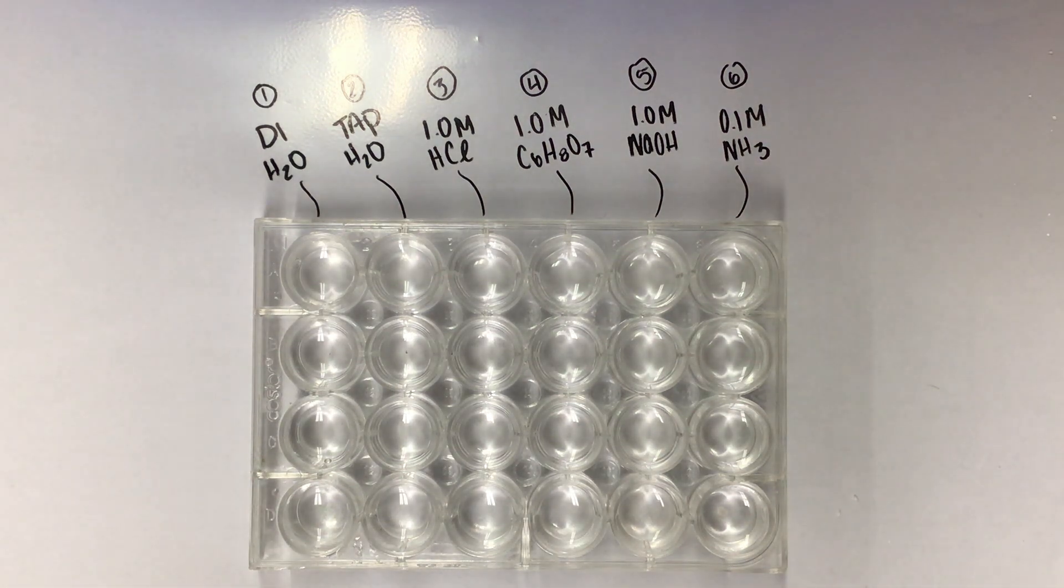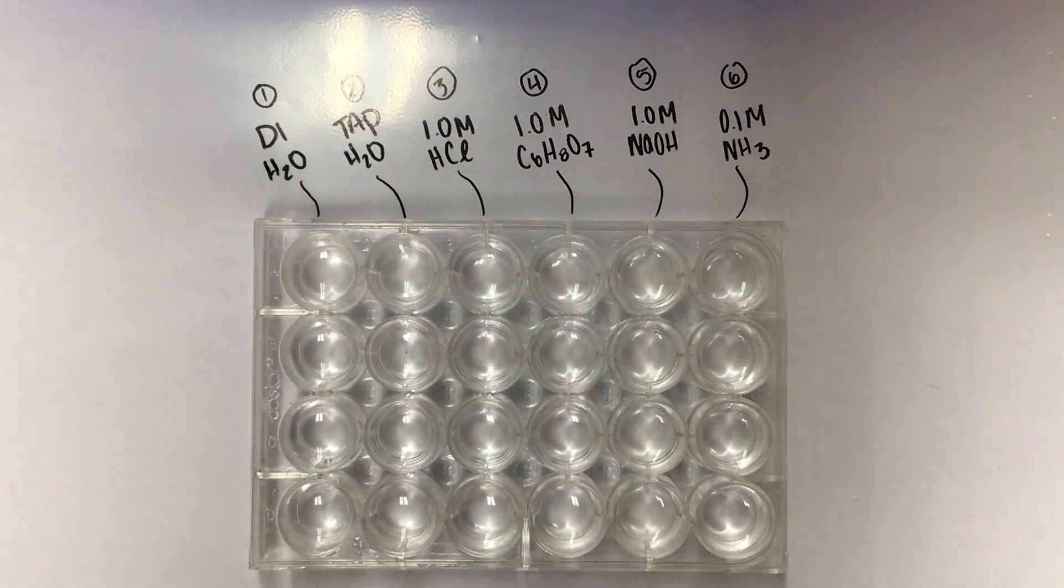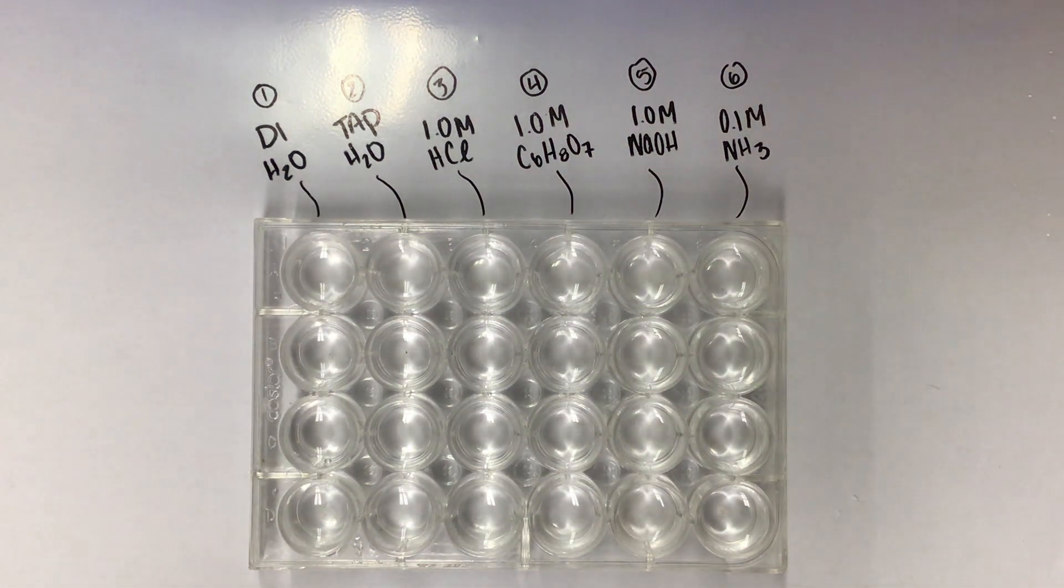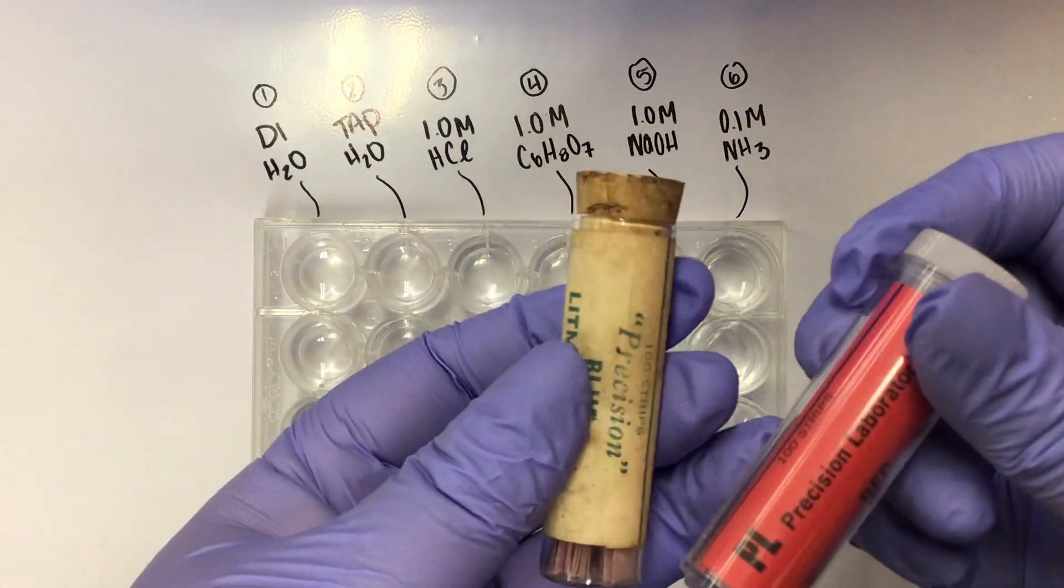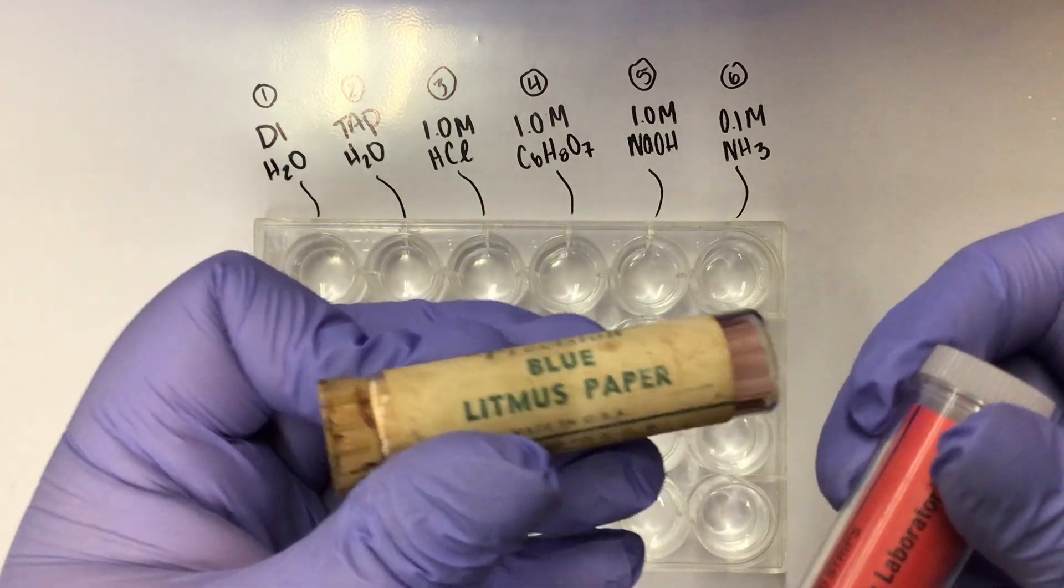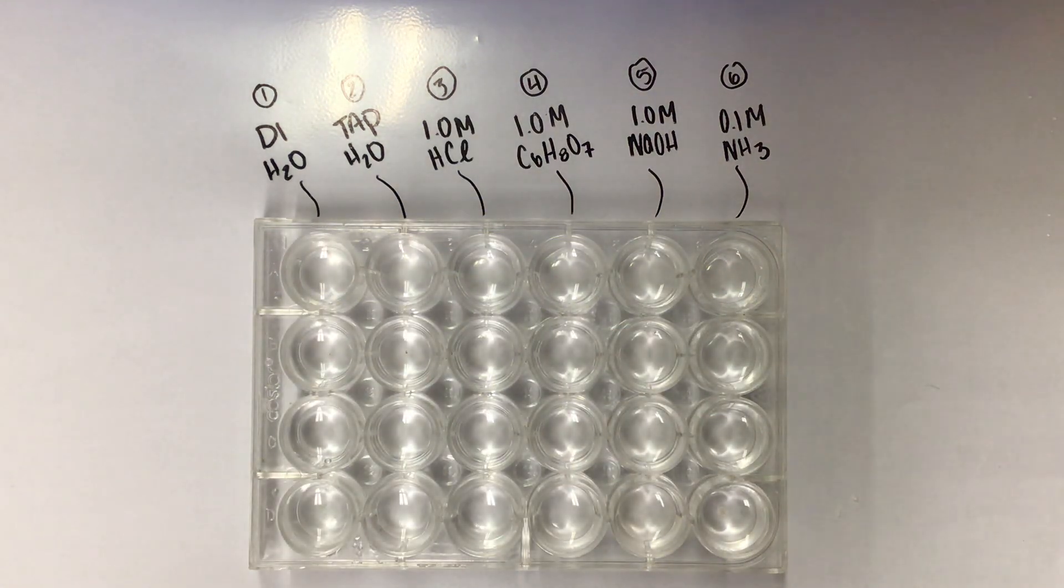Now we're moving on. We're going to do the litmus paper test. There's two kinds of litmus paper: red litmus paper and blue litmus paper. We are going to test each of them. Here's our litmus paper containers. This one's from, I don't know, the 1800s, it feels like. It's a really old bottle.